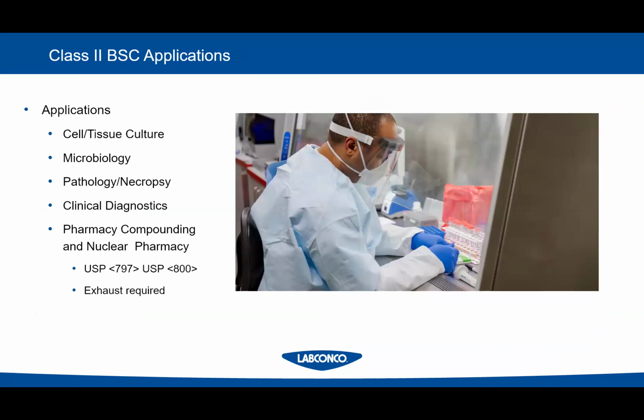When are these used? I would say most biosafety cabinets are used for cell and tissue culture. Transfections, you have cell lines, you have animal cell lines, you have cancer cell lines, you're treating them, you're doing different things with them. All that work is done usually in a biosafety cabinet, right? Protects me, keeps my stuff clean. They're also used in compounding pharmacies. In that type of environment, these are often called chemo hoods, and they're usually exhausted.